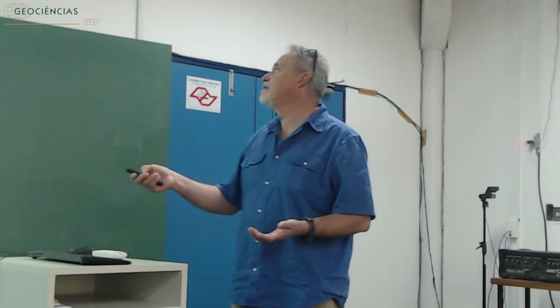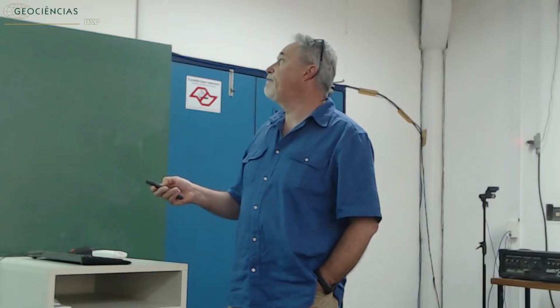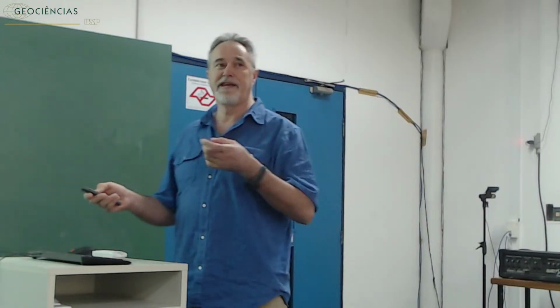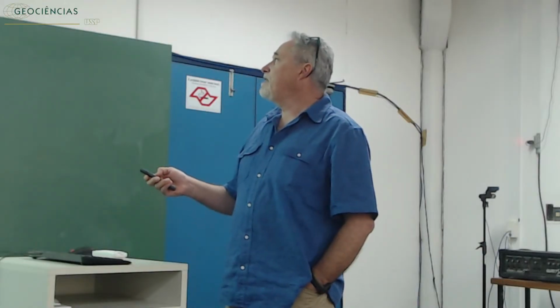But if you don't manage because you are working with synthetic samples, then you downgrade to powder X-ray diffraction, which can give anyway very precise information on the unit cell parameters, sometimes even more precise than a single crystal, because you can use an internal standard like silicon, for example, but can get information also on the atom coordinates.